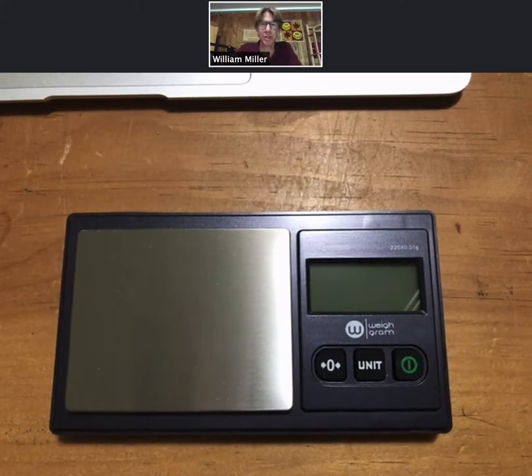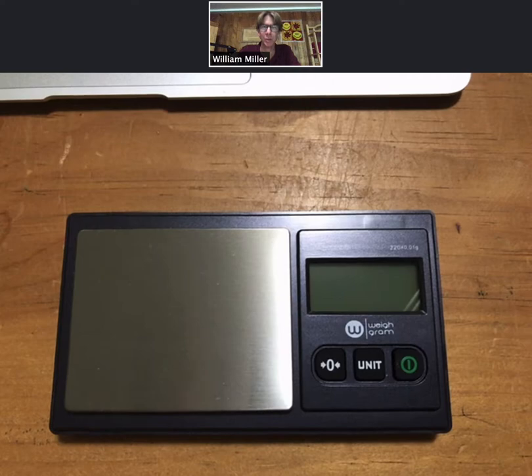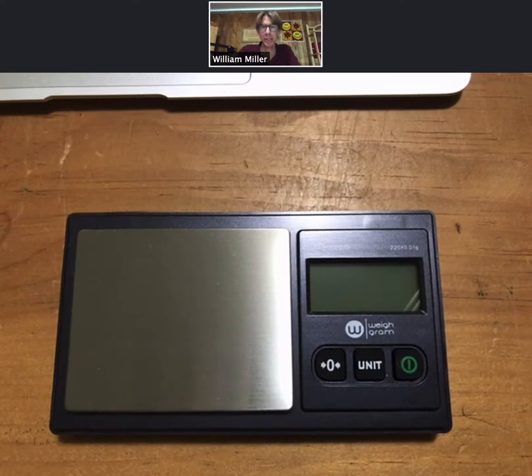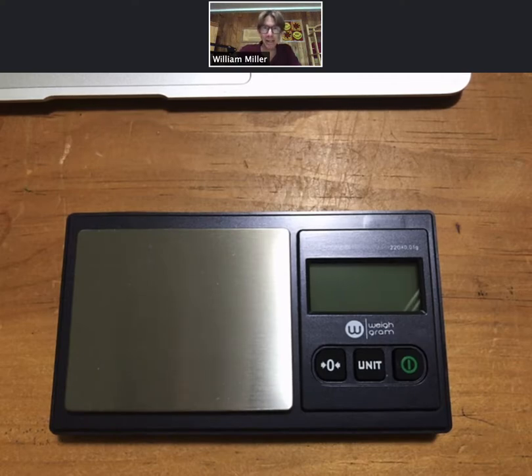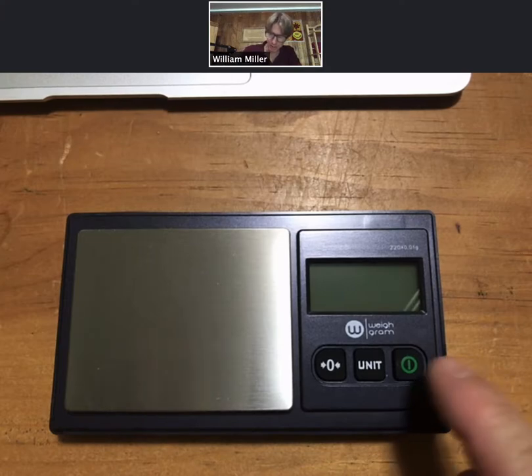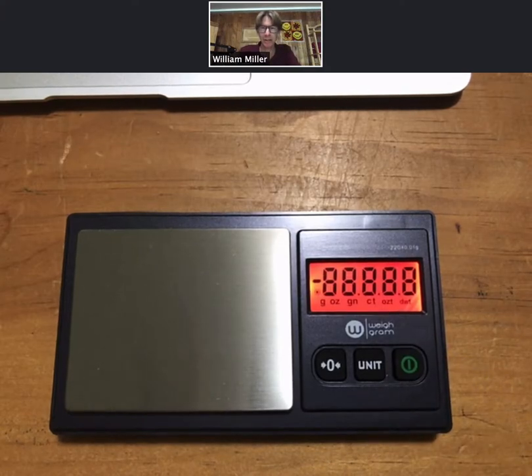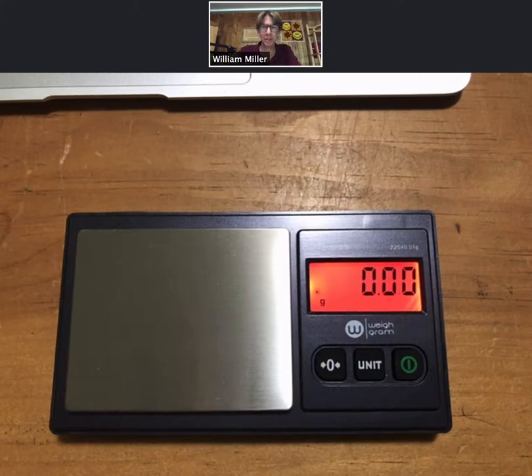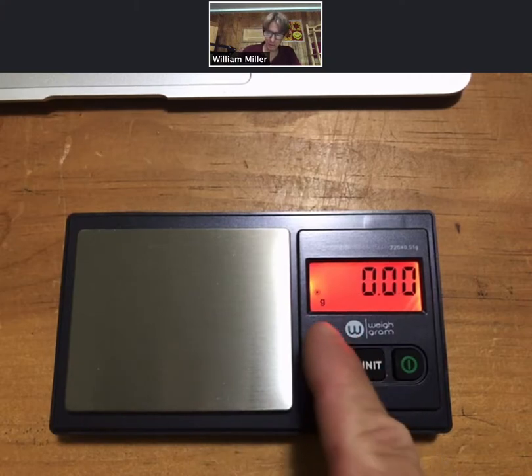One thing that's important is to make sure that you don't put things that are heavier than 220 grams total on top of the scale, because that can damage the scale. I'm gonna go ahead and turn my scale on. When I do, it should go to 0.00 grams.